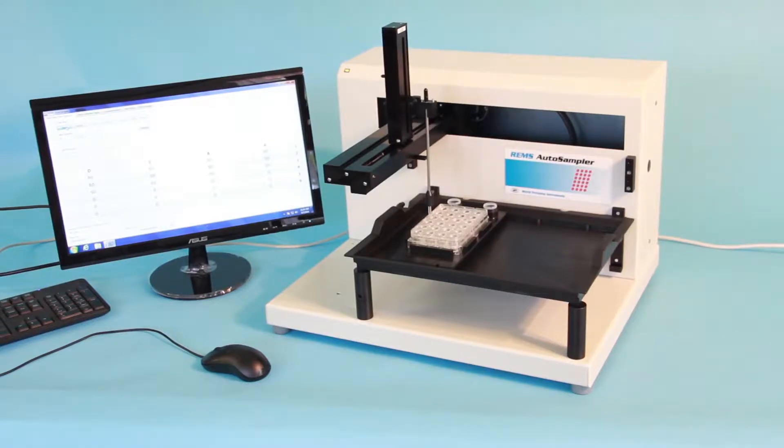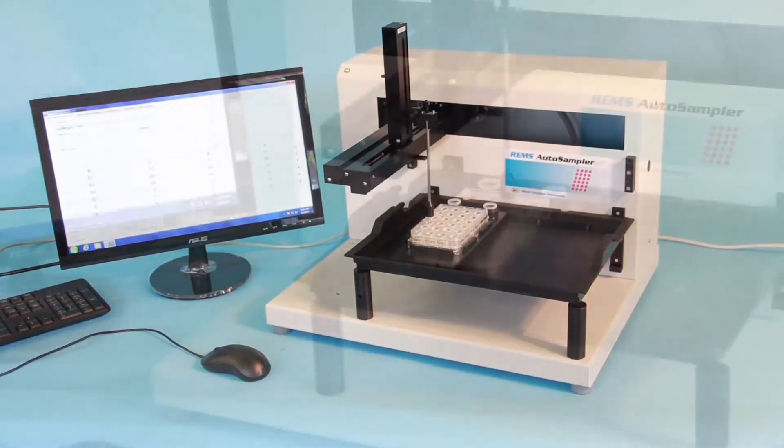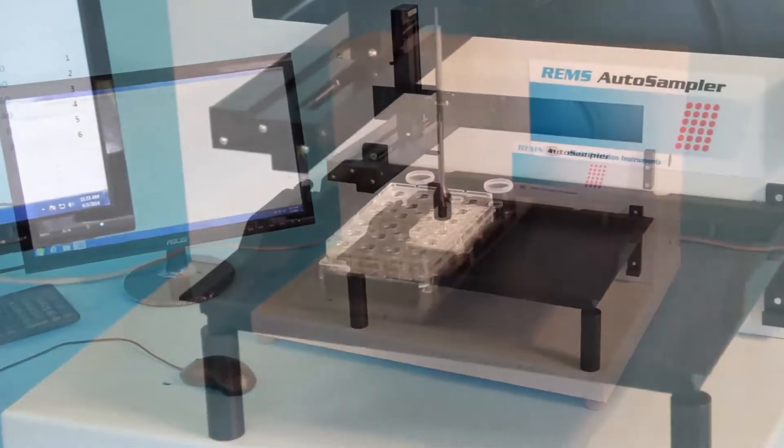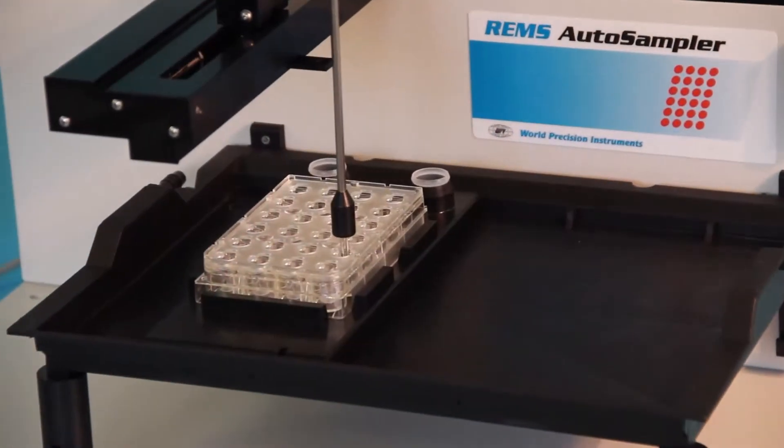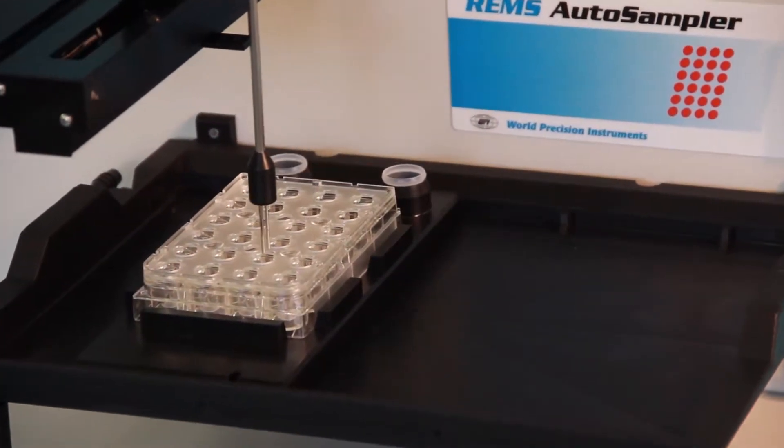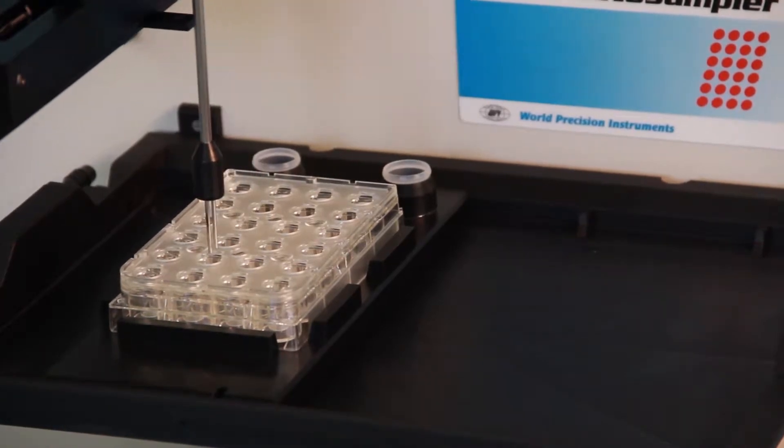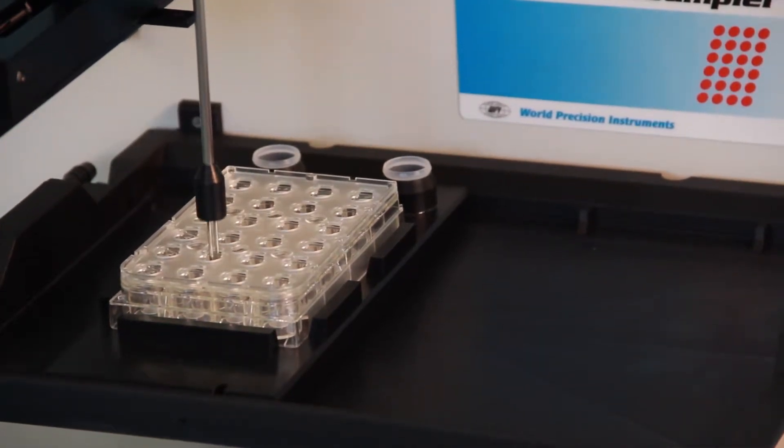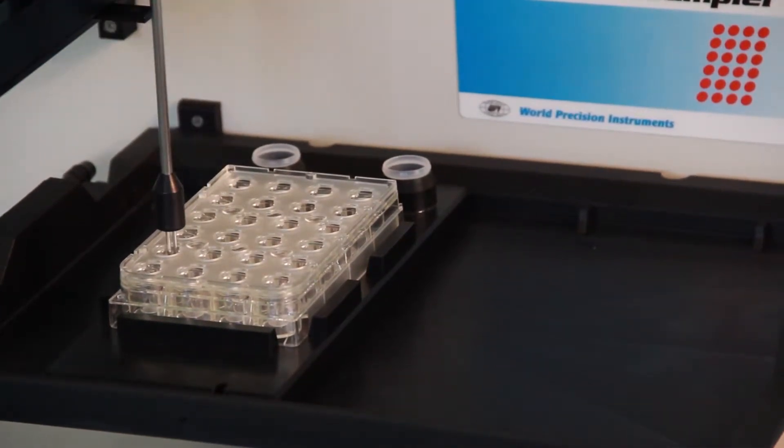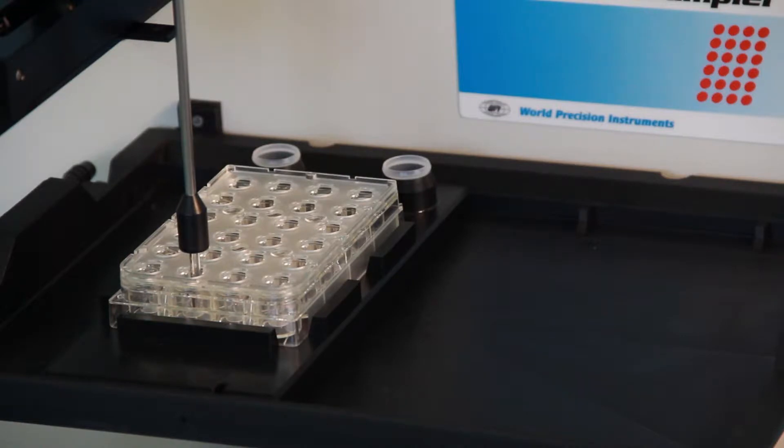If high volume trans epithelial electrical resistance measurements are part of your research protocol, WPI's REMS automated tier measurement system can save your team valuable time and improve reliability of test results. WPI's REM system provides an effective solution for rapid and accurate acquisition of tier measurement data for both 96 and 24 well HTS plates.